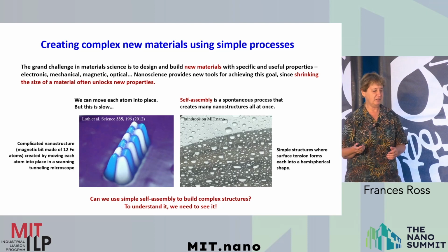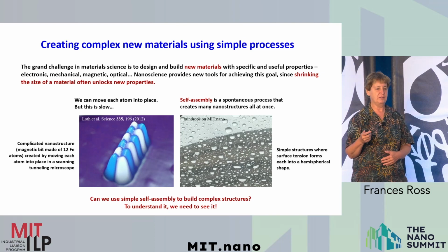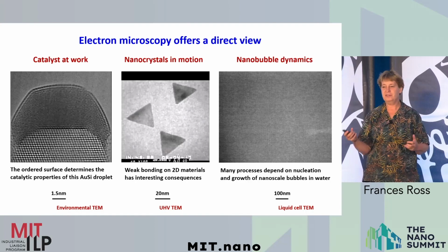Well, our thesis is that if you want to understand how complex structures are built using processes that are spontaneous, or that we would like to drive by setting the environmental parameters, then you want to actually observe those processes at work. And that's where electron microscopy comes into it. So here's a set of examples. I want to show you some movies of different electron microscopy experiments to illustrate the kind of thing you can do in the equipment of the day.